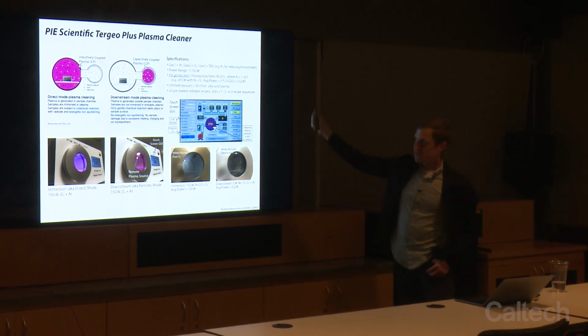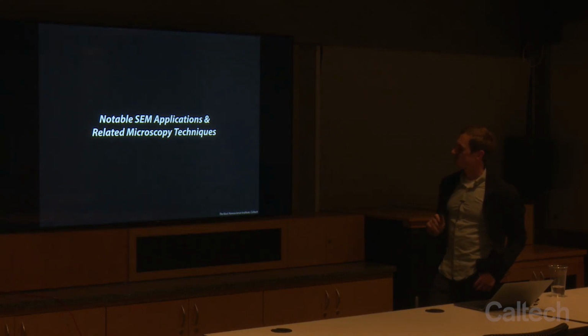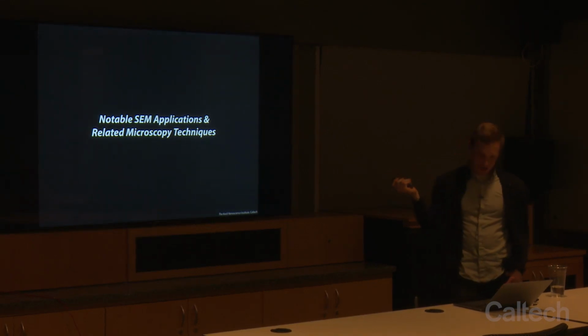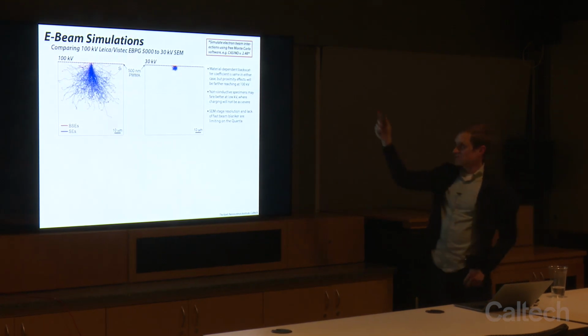Okay, and these are details of that plasma cleaner, which we won't go through today. All right, so here are some notable applications and techniques. I mentioned these e-beam simulations.